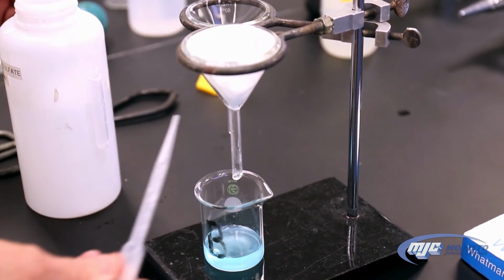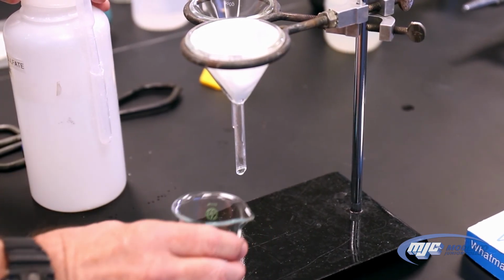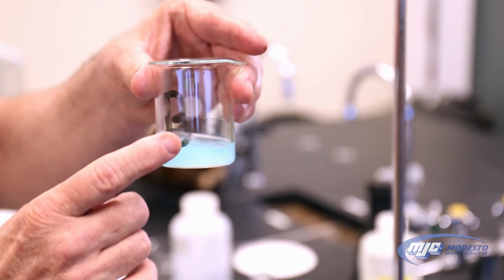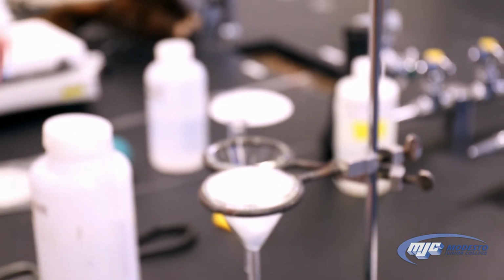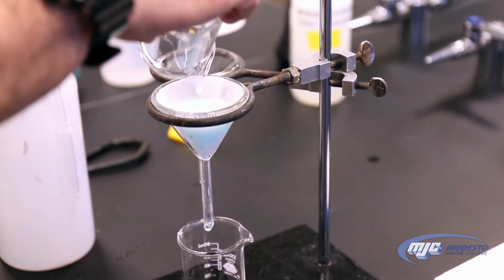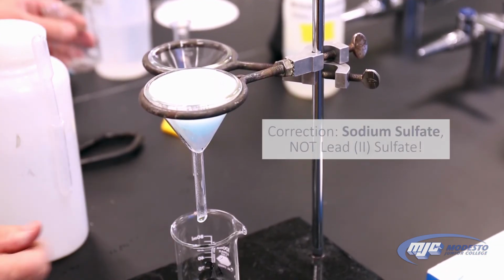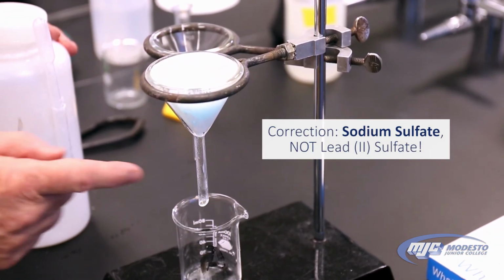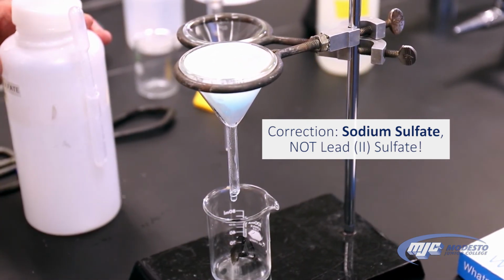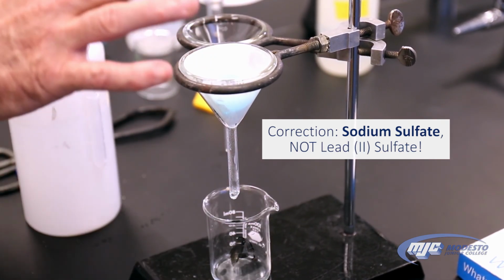Now you can see that when I added that, I did get some white precipitate. That means there was some lead still in here. So all I do is I take my other beaker, put it under here, and add this to the top of that filtrate. And what we do is we keep going back and forth. We let this filter through, wash it, check it by adding some sodium sulfate to make sure that there's not any in there. Once we get no precipitate forming when we add the sodium sulfate to the filtrate, then we can be sure that we got all of the lead 2 sulfate out.